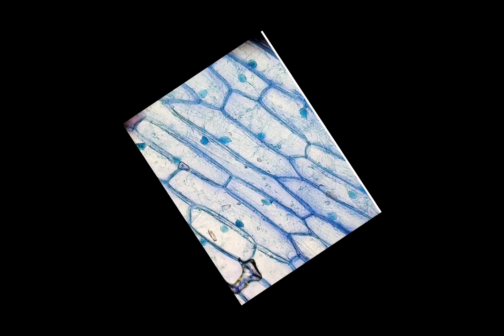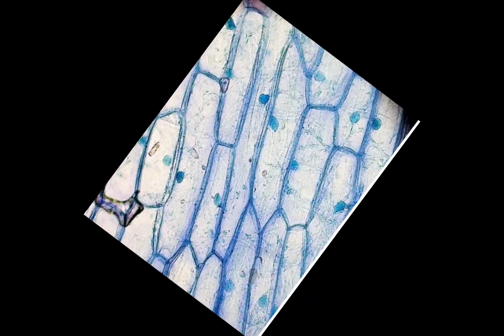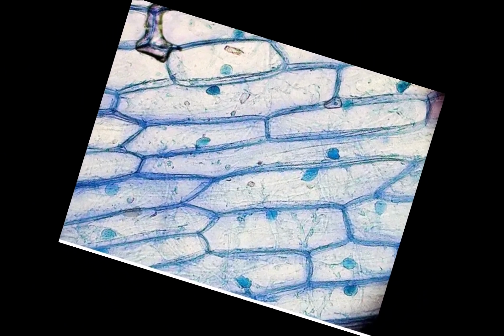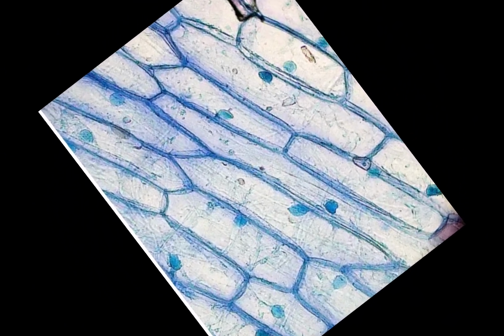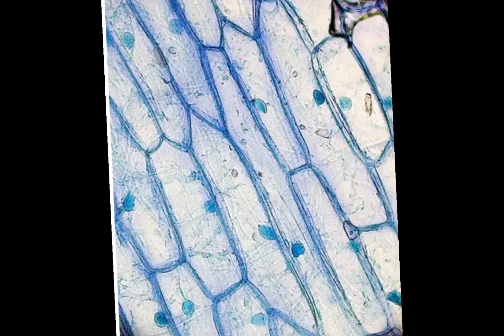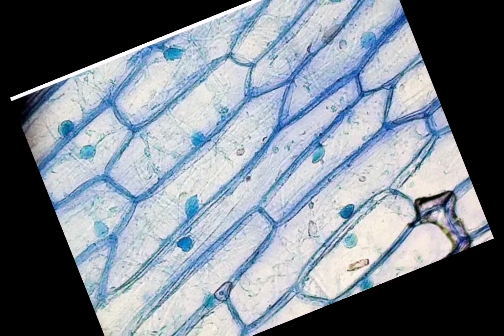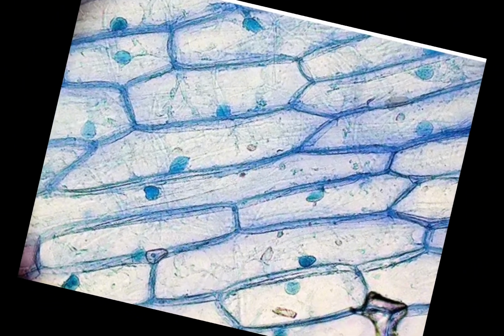We are going to observe large rectangular interlocking cells. We are going to see clearly visible, distinct cell walls surrounding the cells. We'll see a dark stained nucleus, and also we are going to see large vacuoles at the center. We are going to see small granules inside the cell within the cytoplasm.